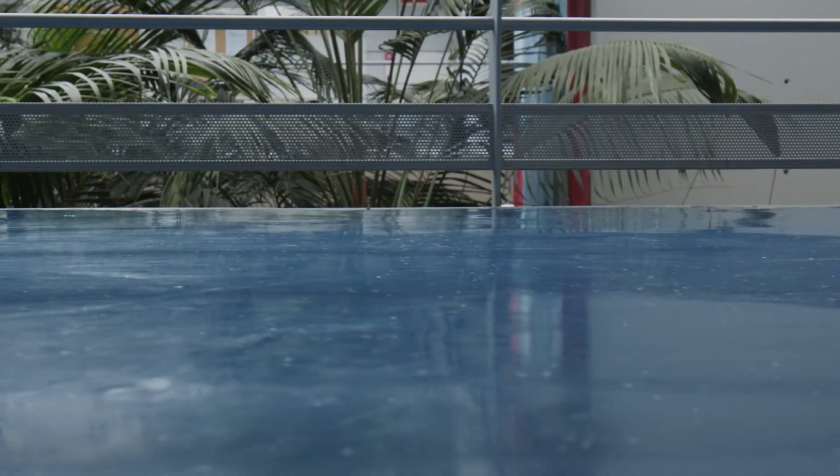The quality of the cells, and especially the homogeneity of the starting aggregates, highly depend on the outcome that we will have once we finish that differentiation. The best way to generate these organoids highly depends on the generation of 3D aggregates prior to the organization. And being in 3D will highly impact the 3D architecture of the organoids that we are trying to derive in vitro.